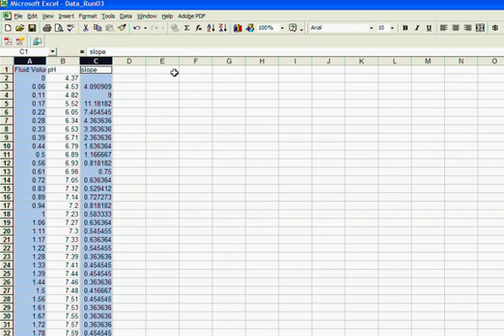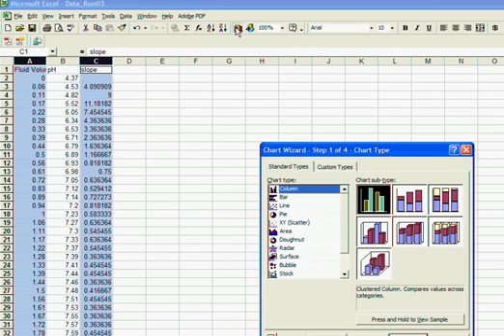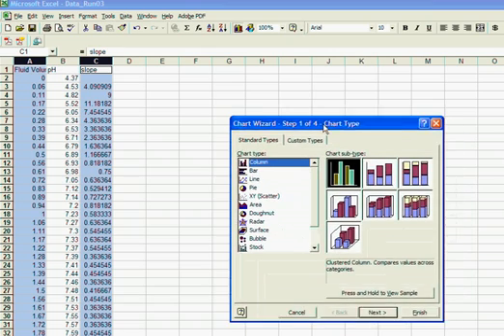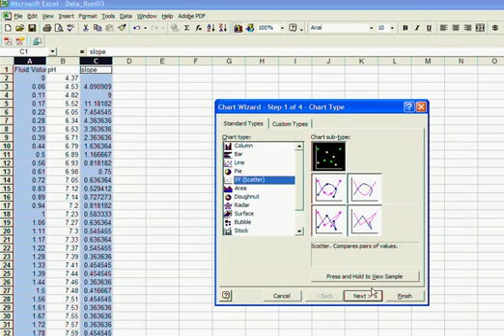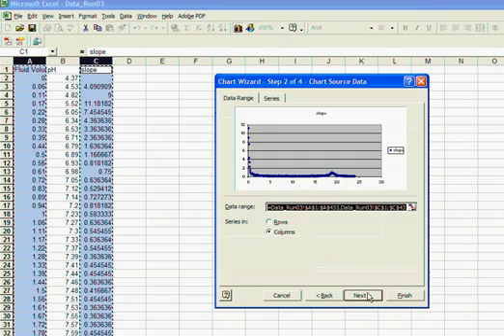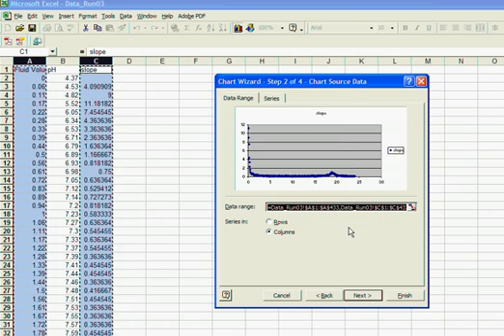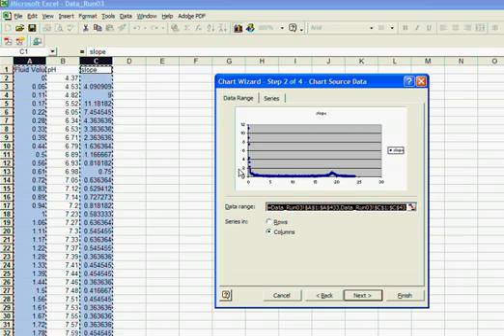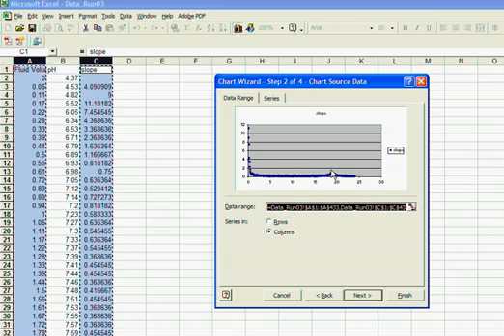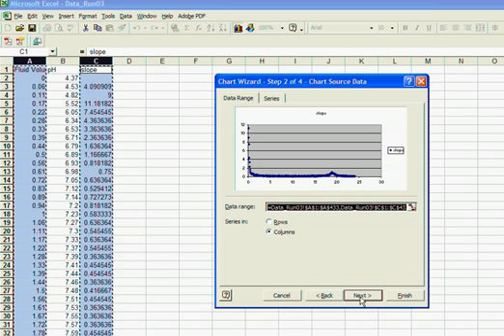So again, I'm going to go back, click on my wizard and tell it I want an XY plot. And I'm going to say OK, that's what it looks like. You see here, here's a point, there's a little peak here. This is where the end point is going to be, the highest slope. Click next.